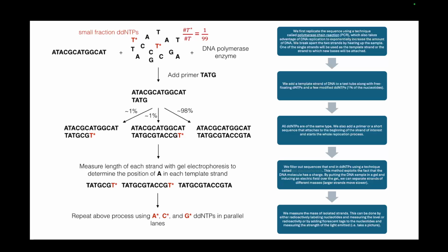of your nucleotides can be your modified ddNTPs. As you see, you have a lot of these dNTPs: T, A, G, C are all dNTPs, and your T stars, here only two are shown, are given as your ddNTPs. Now all the ddNTPs are of the same type.